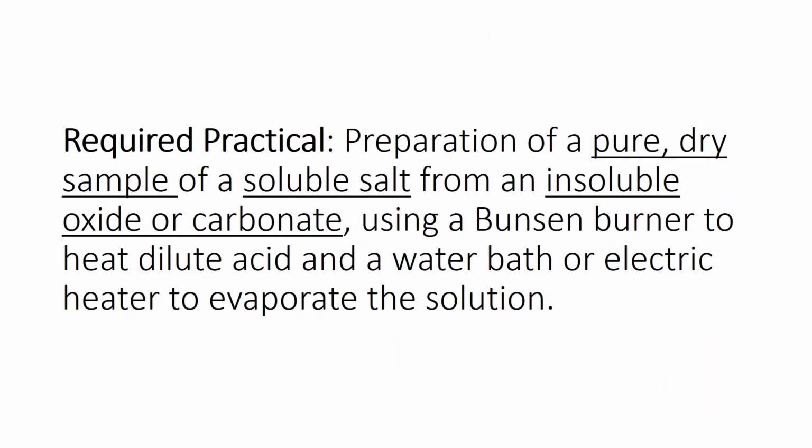The next little thing that's part of our big question is going through the required practical, because our big question really is how to prepare a clean, pure and dry sample of a salt from a base and an acid. So from the exam board, the required practical is preparation of a pure dry sample of a soluble salt, that's a salt which dissolves, from an insoluble oxide or carbonate, in other words from a base, using a Bunsen burner to heat, dilute acid, and a water bath or electric heater to evaporate the solution.